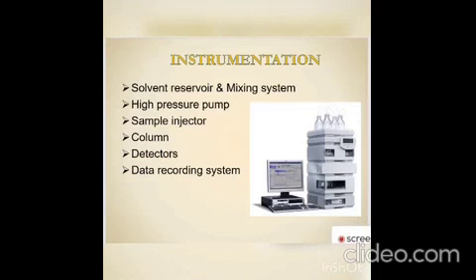Now, instrumentation. The HPLC involves almost 6 parts. There are the solvent reservoir and mixing unit, high pressure pump, sample injector, column, detector, and data recording system.